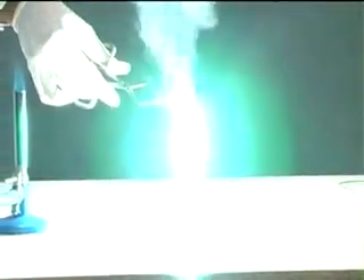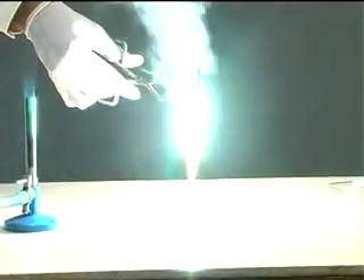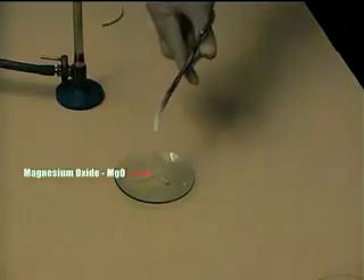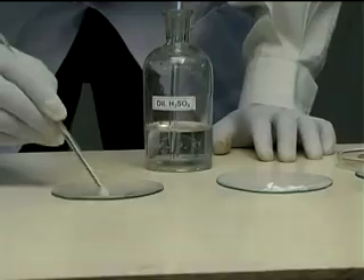The residue on the watch glass is magnesium oxide, and it is a basic oxide. It dissolves in water.